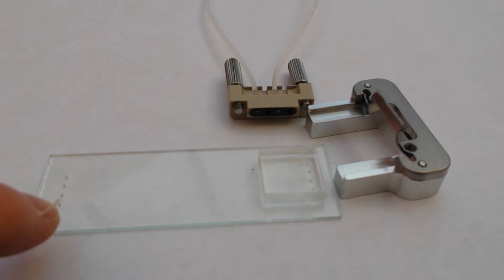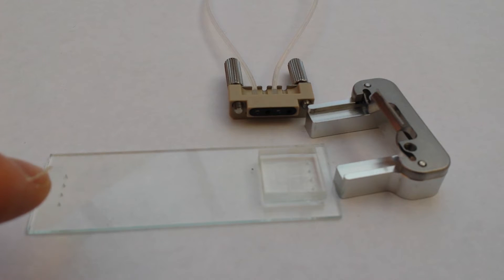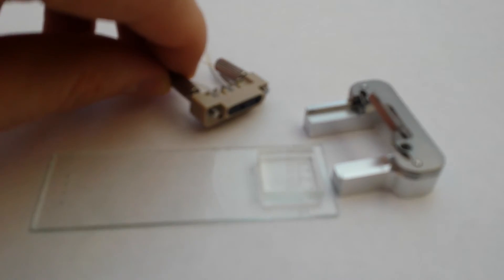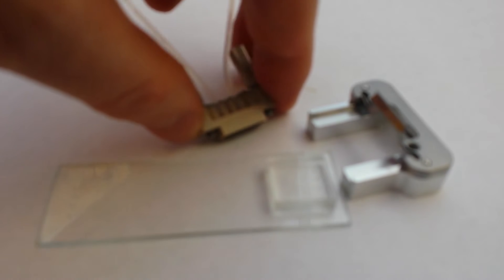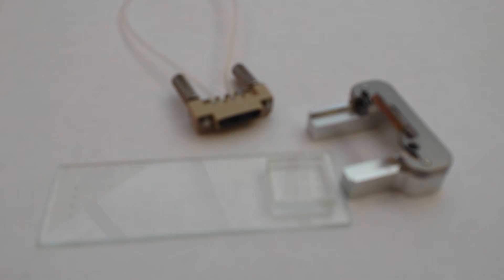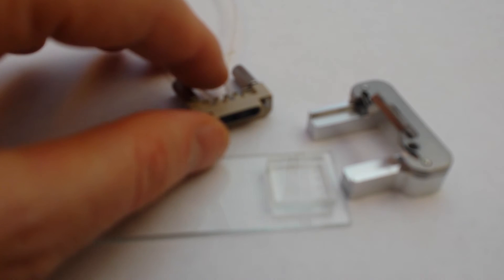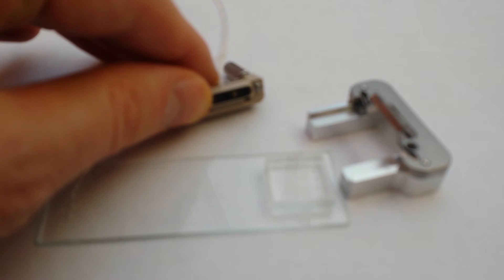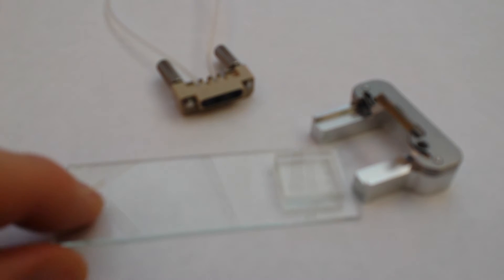What they're doing is controlling or defining the distance from these holes from the edge. They're defining the distance of this hole from this edge, and they've obviously defined the pitch as well. So they've designed these holes to be compatible with their connectors, which allow very good connections onto these holes themselves.